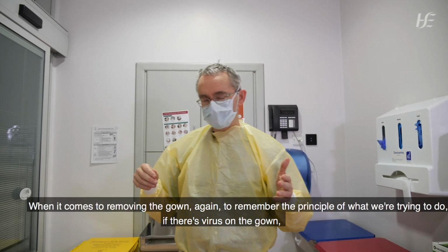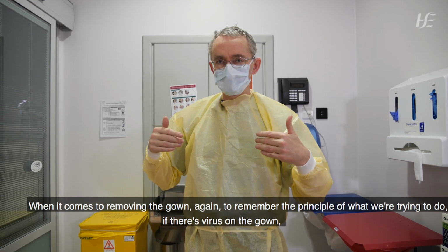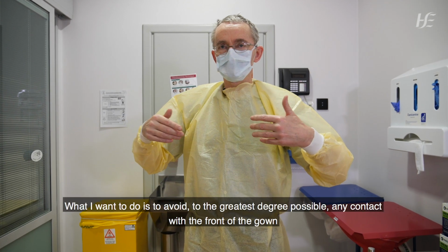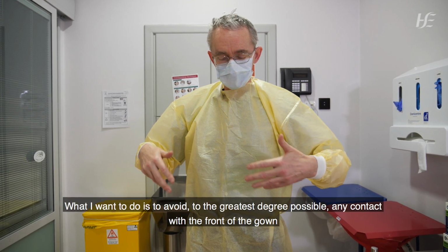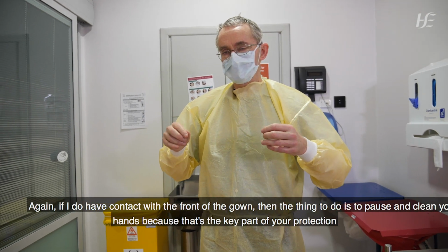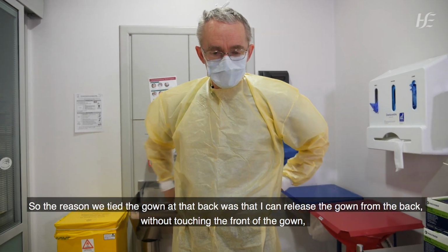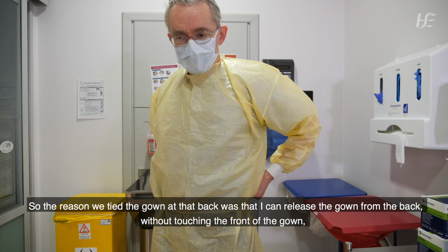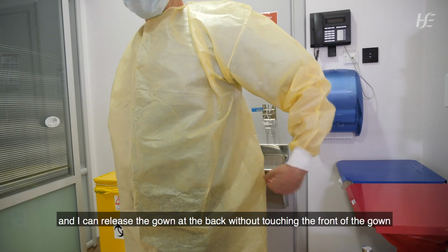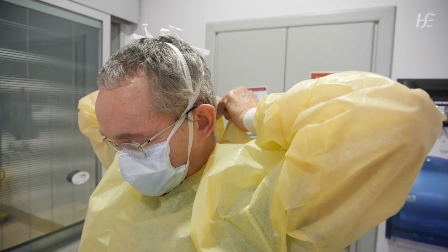So when it comes to removing the gown, again, remember the principle of what we're trying to do. If there's virus on the gown, the virus is likely to be at the front of the gown. So what I want to do is to avoid, to the greatest degree possible, any contact with the front of the gown. Again, if I do have contact with the front of the gown, the thing to do is to pause and clean your hands because that's the key part of your protection. So the reason we tied the gown at the back was that I can release the gown from the back without touching the front of the gown.